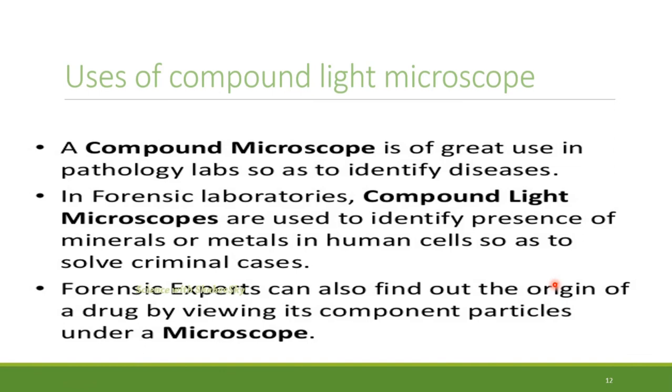Uses of the compound light microscope. Here we go with how to use the compound microscope. A compound microscope is of great use in pathology labs so as to identify diseases. The uses of compound microscopes are large and vast.